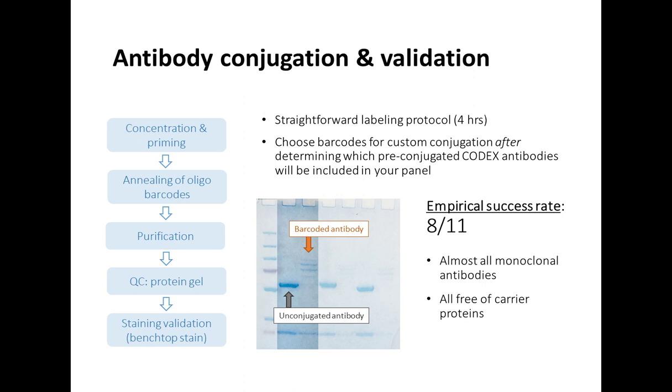And I just want to emphasize here that it was really helpful for us to go over the pre-conjugated list of CODEX antibodies that are available from Akoya, because that really then determines how you choose the specific barcodes that are most appropriate for the custom conjugation.